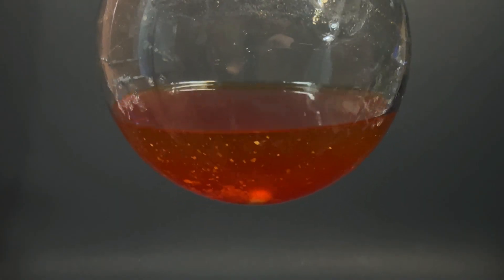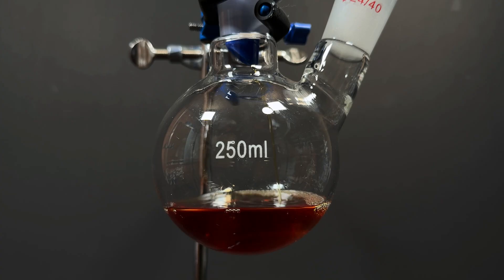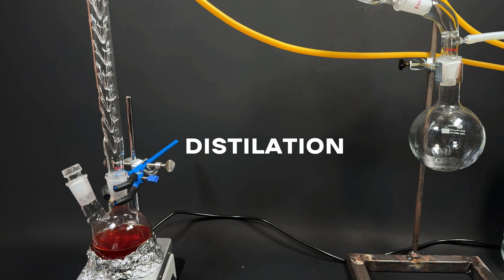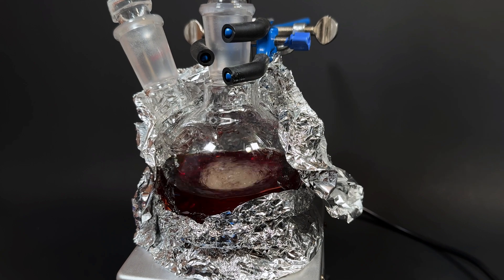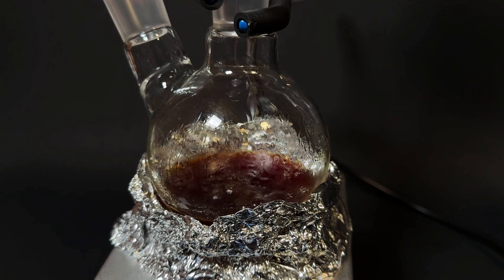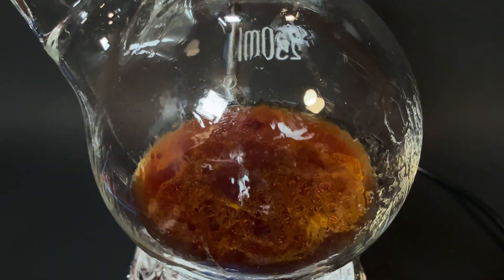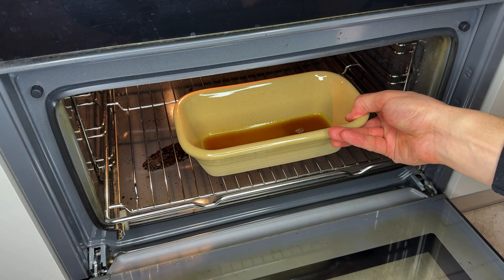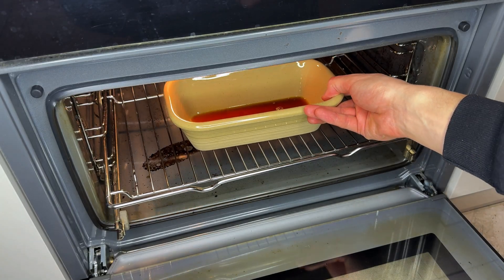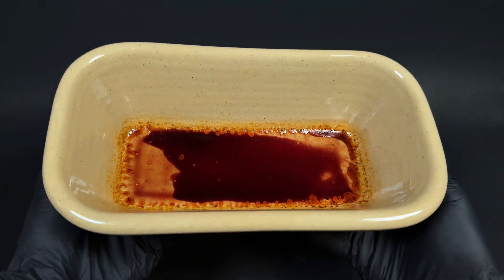I transfer the extract into a second flask, but first I filter it through cotton to remove any small particles from the solution. Next stop: distillation. Assemble the distillation setup and turn on the heat. The ethanol evaporates, passes through the condenser where it cools and drips into the receiving flask. What's left is a thicker concentrate, with the ethanol gradually evaporating — but we do not let it fully dry out. I transfer the remaining liquid into a tray and pop it into the oven at 50 degrees Celsius for a few hours. In the end, we are left with a thick resin with traces of essential oil.